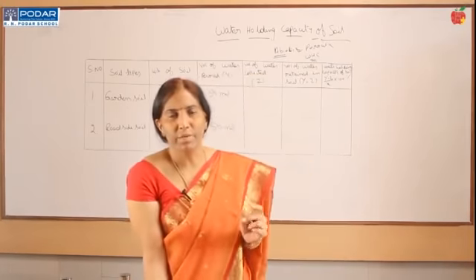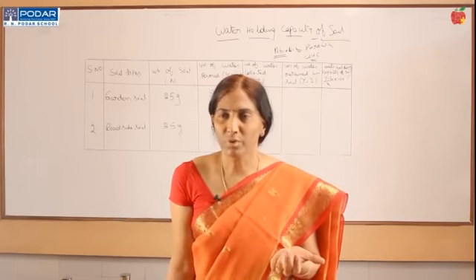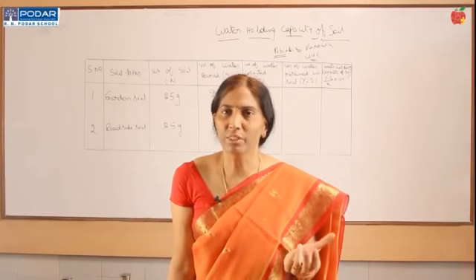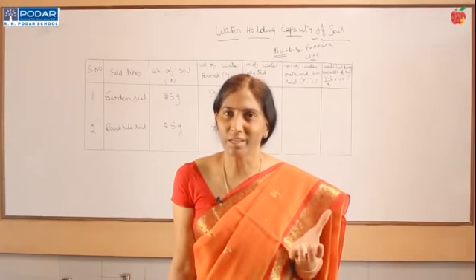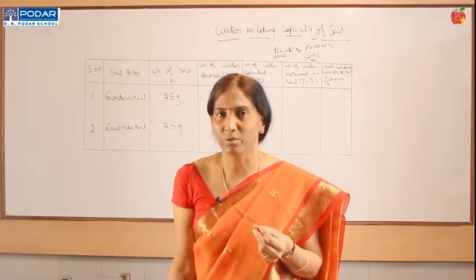So, the aim of our experiment is to show which soil is suitable for plant growth. Obviously, the soil which can hold the maximum amount of water, which can retain the maximum amount of water, is suitable for plant growth.